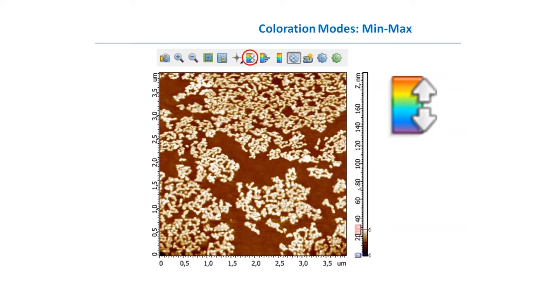The first way is to change the minimum and maximum of our palette. If we press this button in our toolbar, we can change the color position which corresponds to the maximum, so all pixels higher than 27.8 nanometers will be white and will not give us any information, but the whole gradient of the palette will apply to the pixels which have meaningful values.